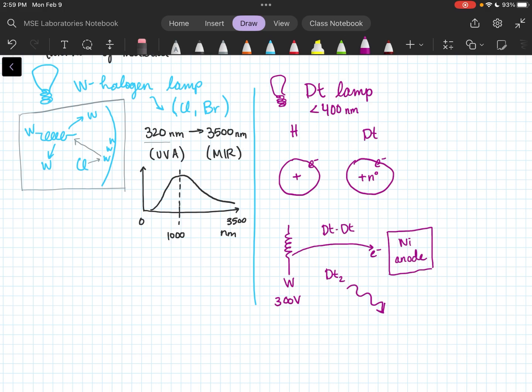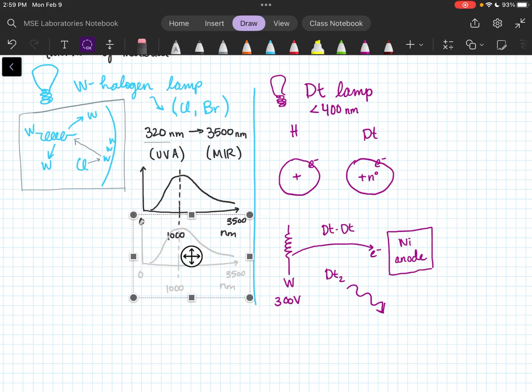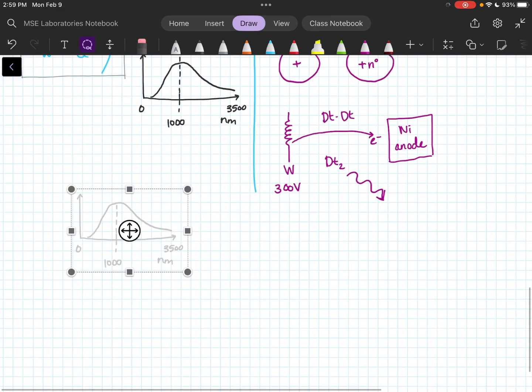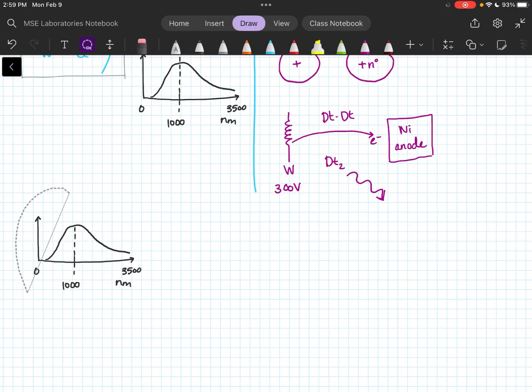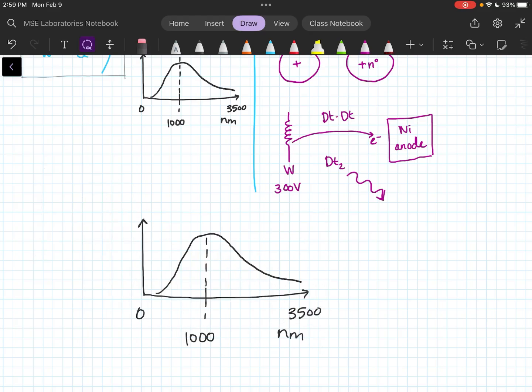And like I said, it does really great down below 200 up toward 400. It does not put out wavelengths much above 400. And I could draw the same graph like I did, but it would be from 400 and up. So if I were to, let me actually bring that down to the neutral zone down here, outside of what I was talking about there, and make that a little bigger.